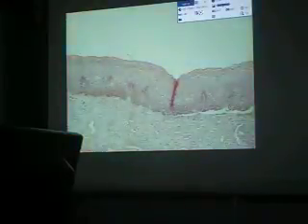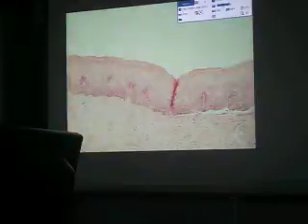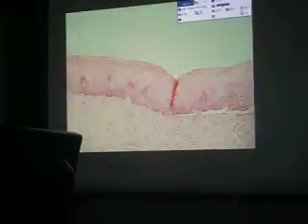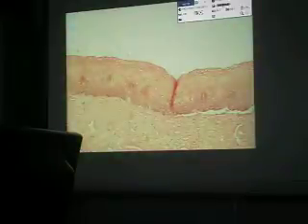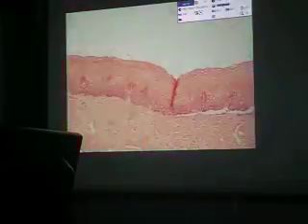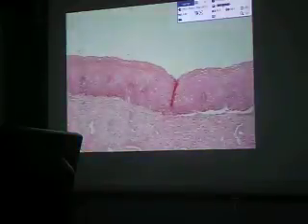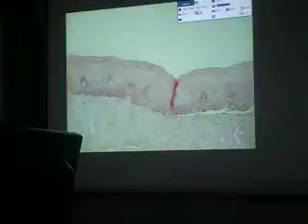So as the squamous cells ascend to the superficial layer, there is gradual decrease in the nuclear size, because eventually the squamous cells will die after 2 to 3 days after reaching the stratum corneum, or the most superficial layer of the stratified squamous epithelium. Thus, there is a normal maturation pattern that is displayed by the cells as they ascend to the superficial layer.